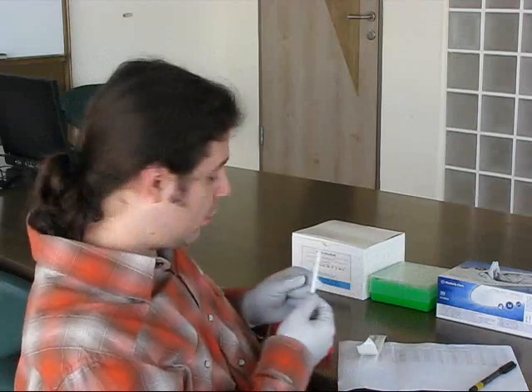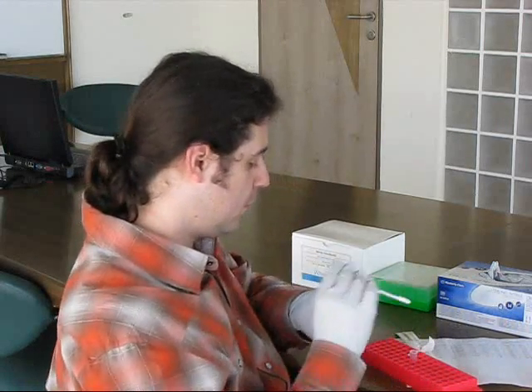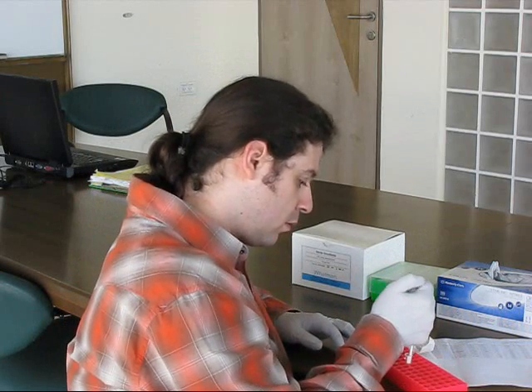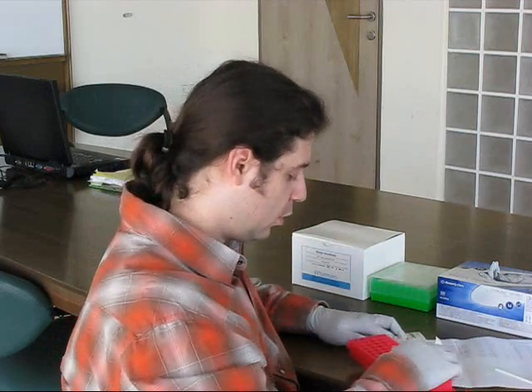After that, I take the stick from the patient, open carefully the tube, and eject the head into the tube. Close.